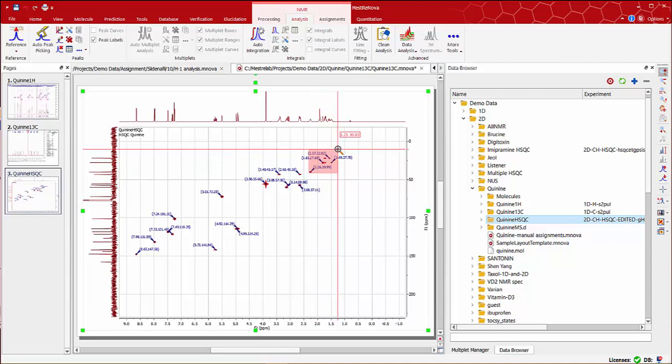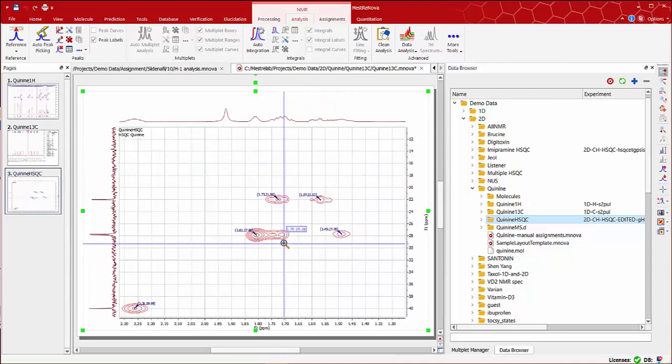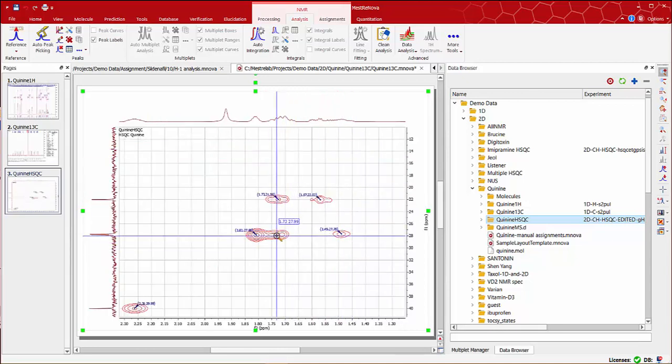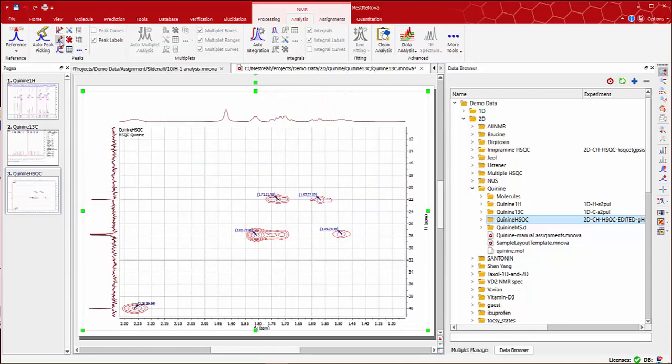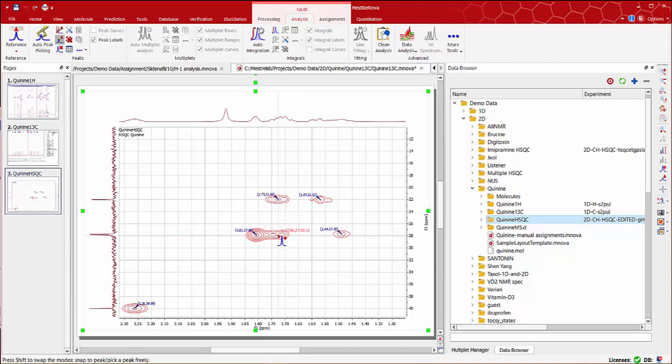In this region we can also see how one of the peaks seems to be missing. In this case we can use the manual peak picking tool, peak by peak, and easily add it to the spectrum.